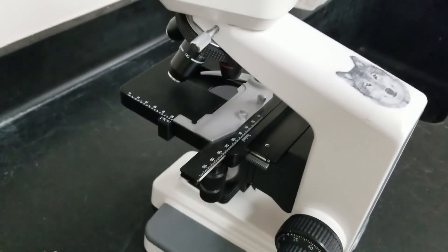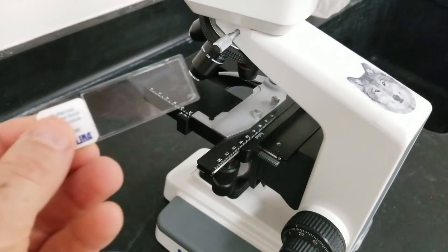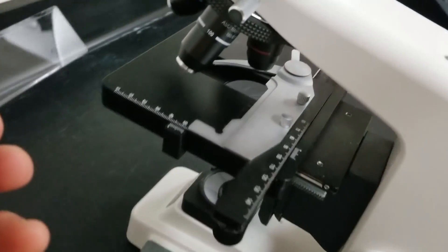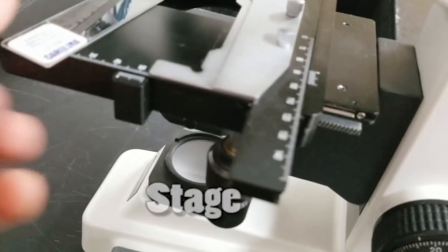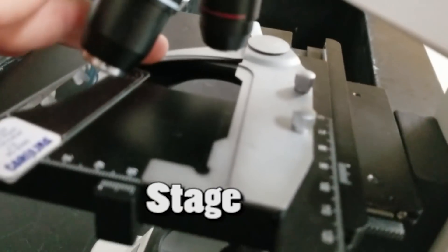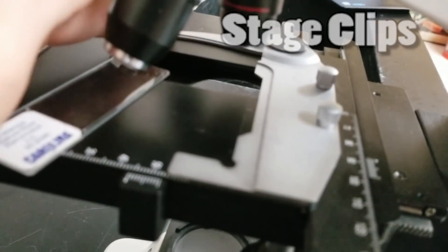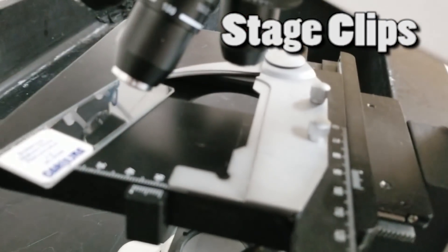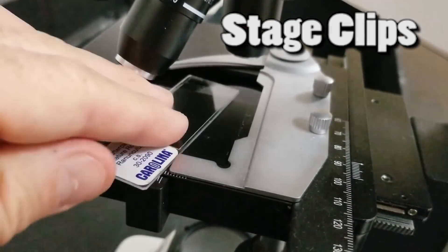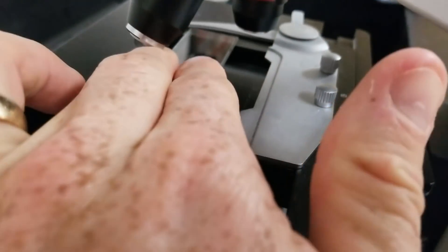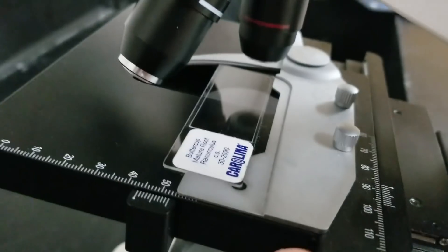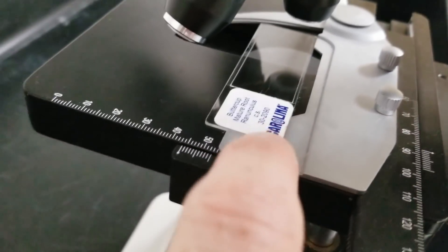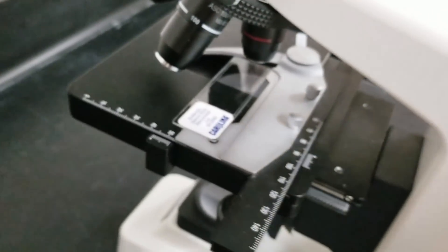The actual slide. Here's an example of an actual slide. This is going to go on this black plate called the stage. There is a little metal arm right here that will hold it in place. You will place it in there and it will slide right into this little spot. Notice how it has a little corner that it'll fit into.